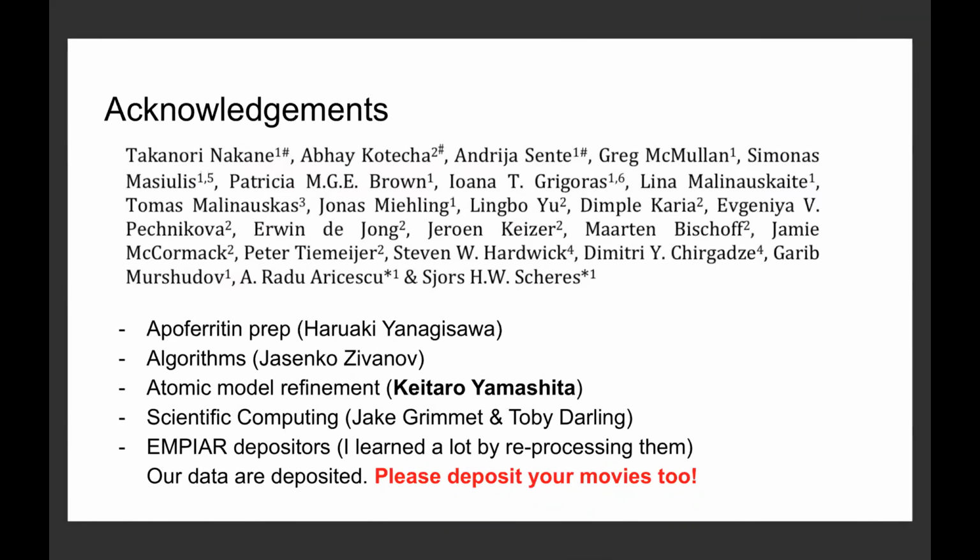Okay, so I think for this high resolution work, the improvement of the envelope function due to the Cc effect is the most important. For other things, for example, whether an energy filter at 5 or 10 eV is better than 20 eV, I don't know. I initially planned to do these more comprehensive tests, but COVID stopped all these experiments, and then nothing happened since then.